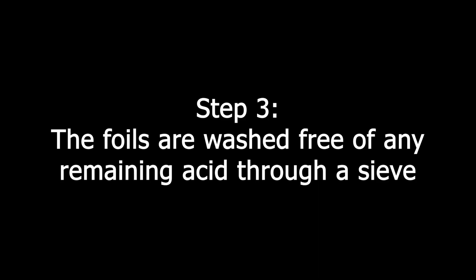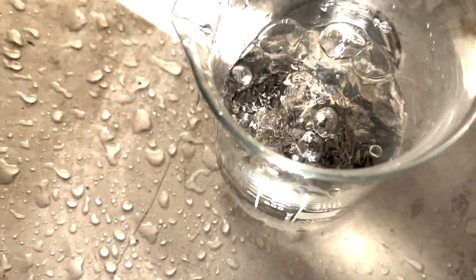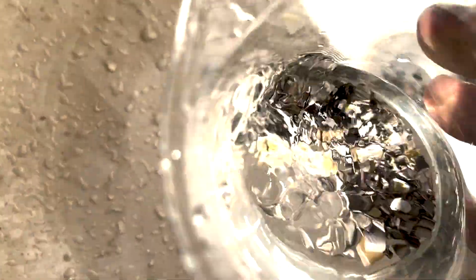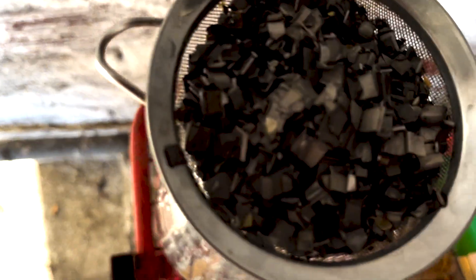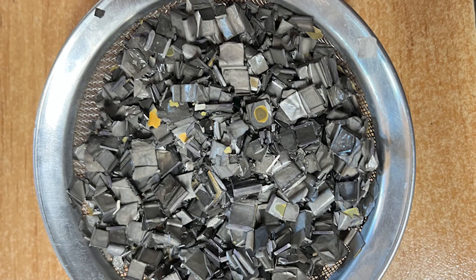Step 3. The foils are washed free of any remaining acid through a sieve. Step 4. Foils are moved to a coffee filter paper and carefully compressed to squeeze out as much water as possible.